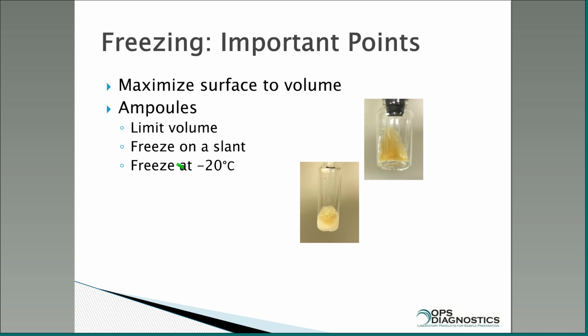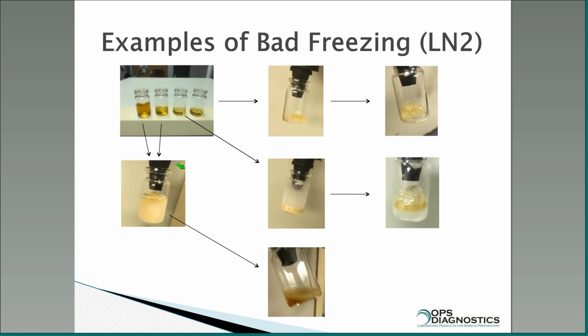Now, I talked a little bit ago about what not to do. Here are a bunch of samples that I freeze dried using liquid nitrogen, and I want to show you the result of these. Up here we have four, I think these are 10 ml vials, and I have these stoppers that you can push in them, and then this will hook right into the manifold on the freeze dryer.